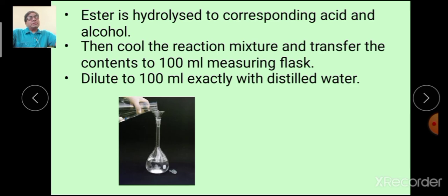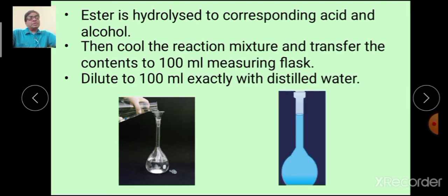The dilution is shown in this. This is the volumetric flask, or this is a measuring flask of 100 cc, and the mark is there. Up to the mark you have to dilute. I will show the total volume with this, which is diluted. Okay, as we have shown the color to identify how much the quantity is, that is where is the mark. Okay, where is the mark.